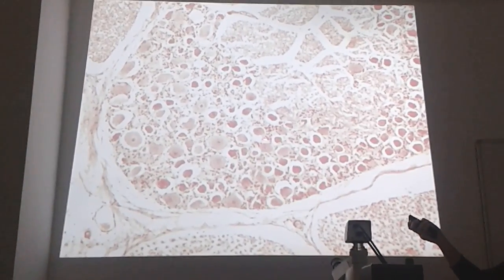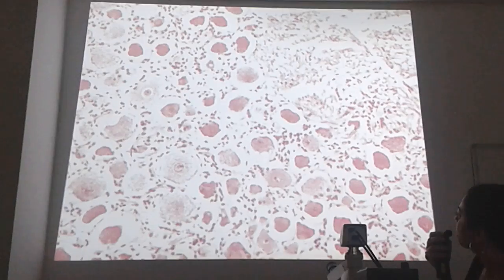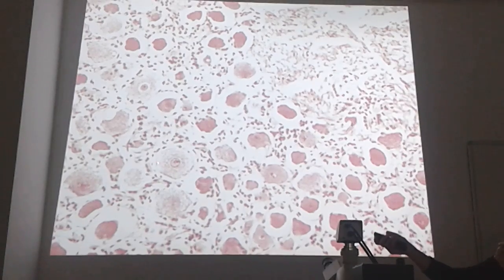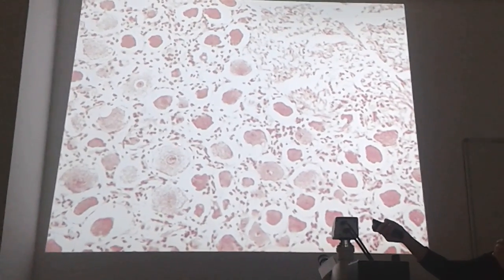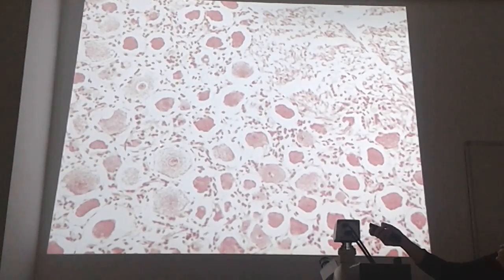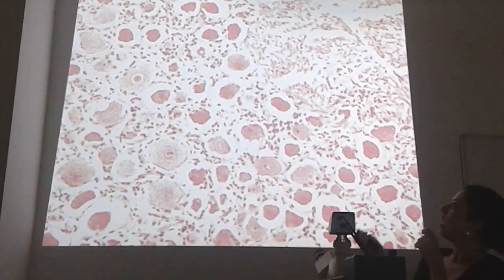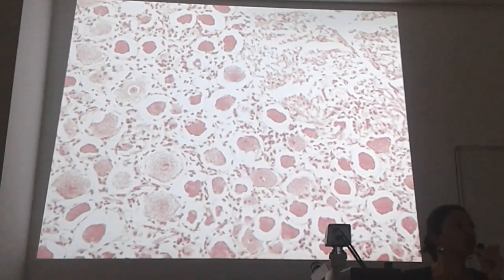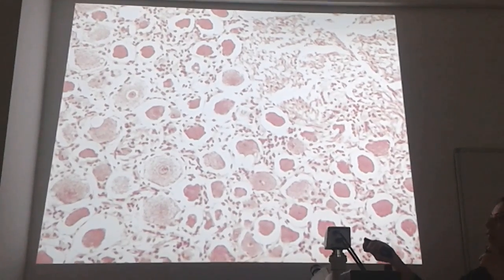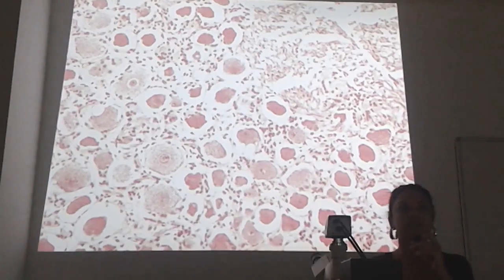And these neurons, these ganglia, are also surrounded, let me put it in a higher magnification. See, these are all ganglia, and these ganglia are surrounded by cells which are called satellite cells, okay? These are glial cells, and these are satellite cells, okay? I have shown you here the dorsal root ganglion, and these are all ganglia which are pseudo-unipolar, and the cells that surround all these ganglia are called satellite cells.